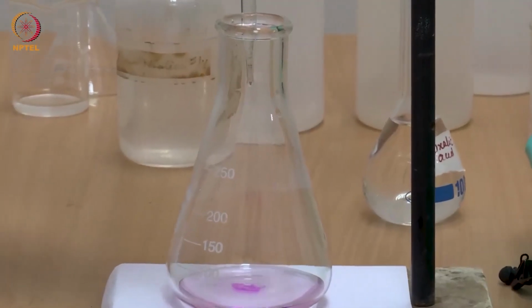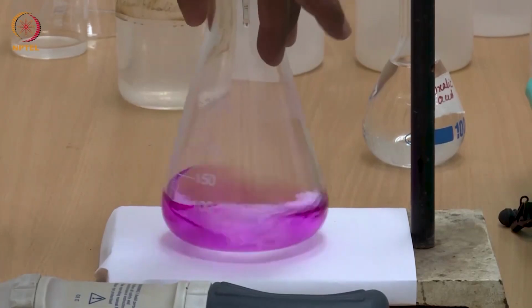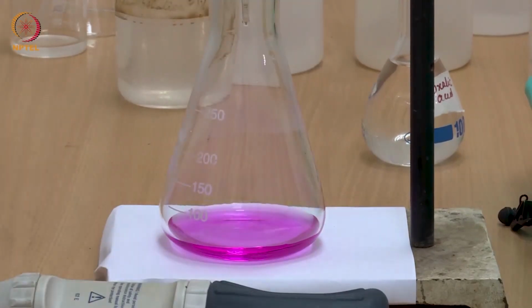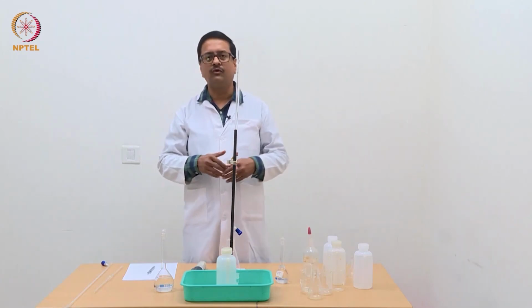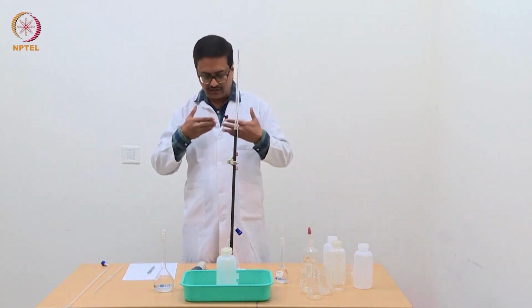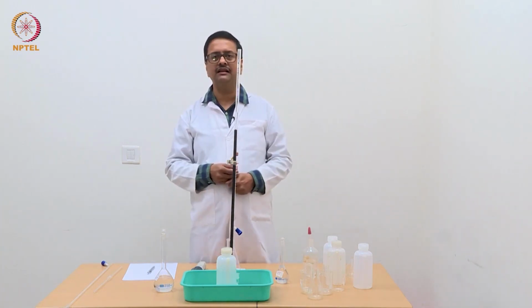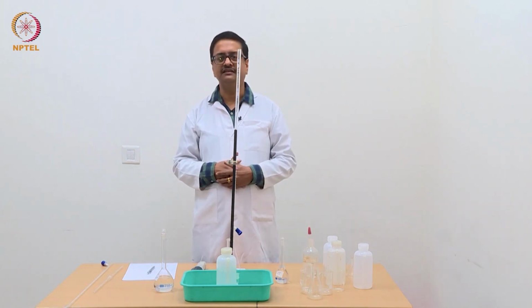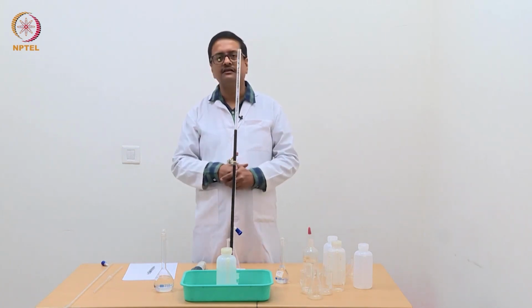So I am just carefully adding one extra drop. It will only intensify the color and nothing else. So that previous point was my actual end point, and this is one drop of NaOH extra added. One should take care that you don't overshoot your end point, because after you overshoot your end point, then on excess addition of NaOH, it will only intensify the color and will give you erroneous reading. So we should do this experiment at least 3 times to get concurrent reading.